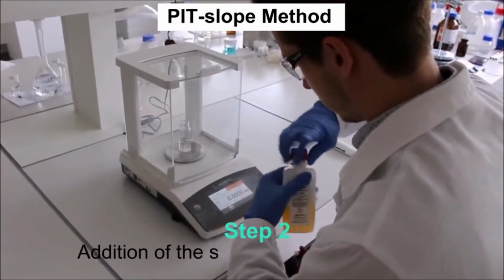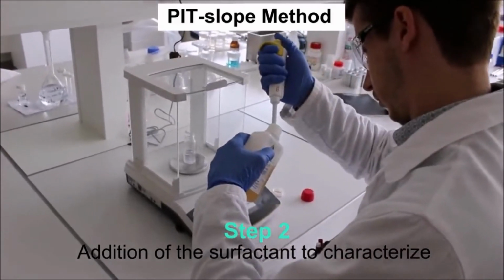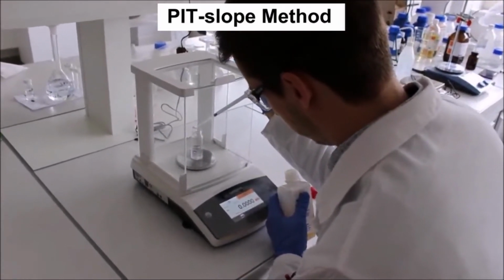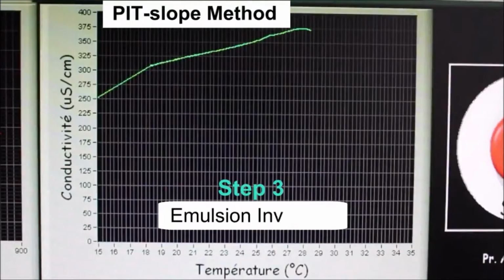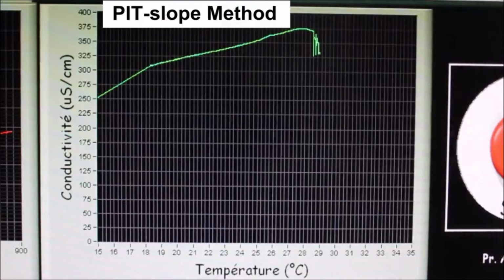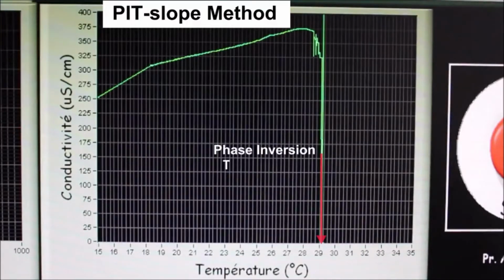Step 2. Addition of the surfactant to characterize. The surfactant under study is added in small aliquots to the reference system. In this case, we will study a commercial sophorolipid, a biosurfactant. For each aliquot of the sophorolipid, the phase inversion temperature is determined in the same way as for the reference system. Here we have the conductivity temperature profile, and we can see that the phase inversion temperature increases to approximately 29 Celsius degrees after adding the sophorolipid.